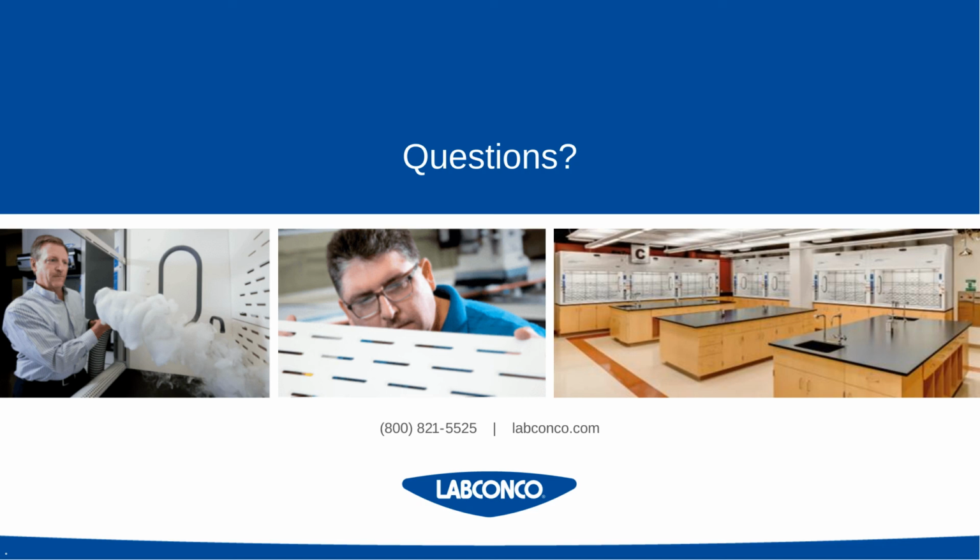Yeah, so the answer to that one is likely not, because there's a couple of issues with that. Whenever a hood is put in place, it's certified there. It's tested, or should be tested and certified, in the location that it's in. If you're moving a hood from room to room, the conditions are entirely not the same, and there's no guarantee that the hood will be placed next to a door or an air supply register or something like that, which may affect the performance of a hood in a way that wouldn't be acceptable if it was tested in that new space.